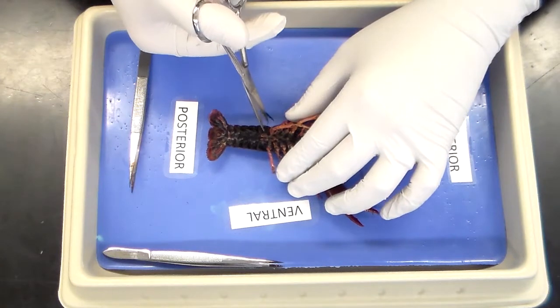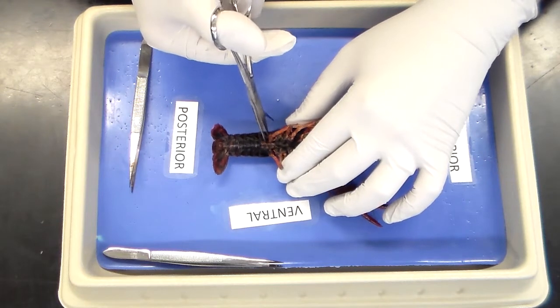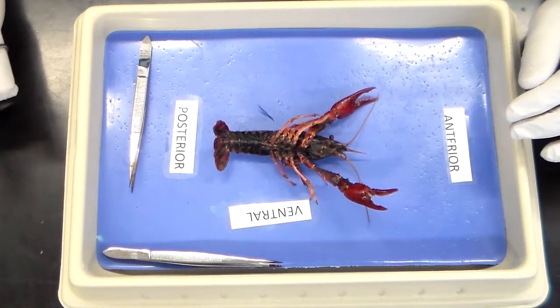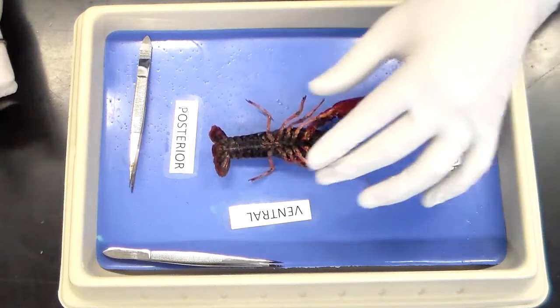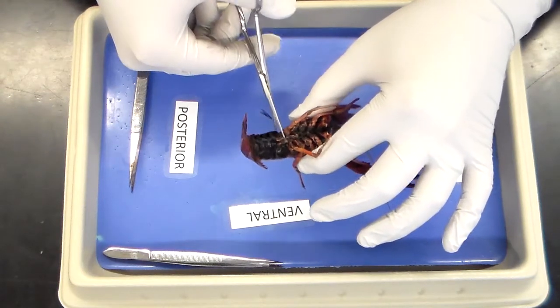The next thing I want to do is make a small shallow incision between the abdomen and the cephalothorax. You might notice some twitching. From here on, we're going to completely remove the abdomen from the cephalothorax.